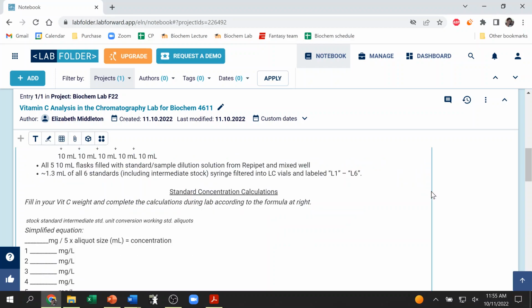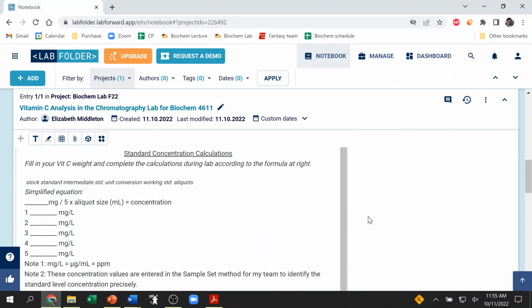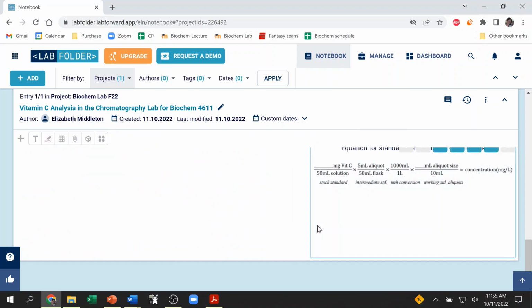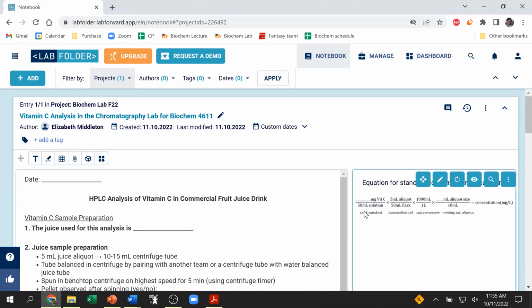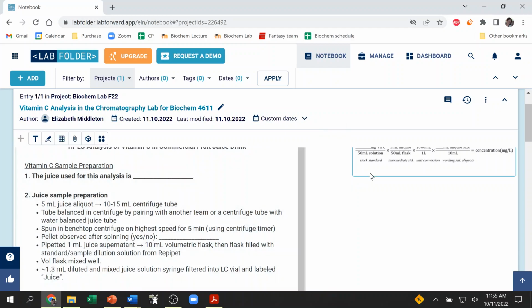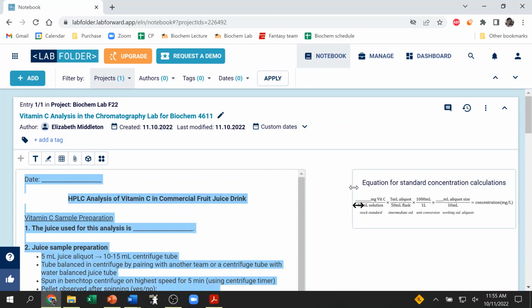And let's make this a little bit narrower. Oh, a little bit more, apparently. There we go. So once it's narrow enough to fit side by side, they'll line up like that. So we can make it smaller this way too. That might be a little too small, but again, you can just keep playing around with it until you get it looking the way you like.